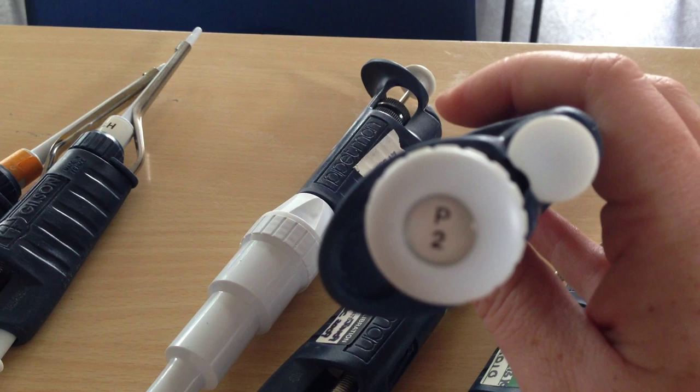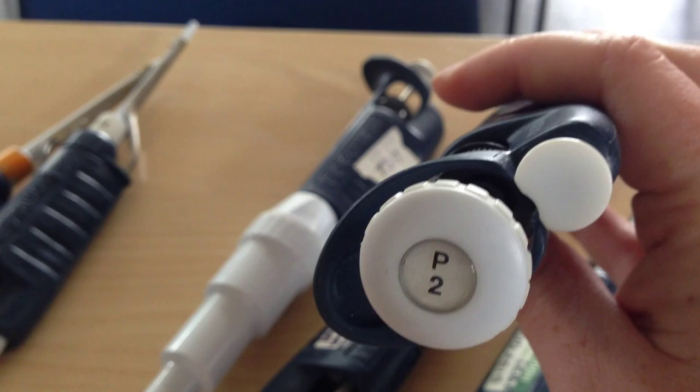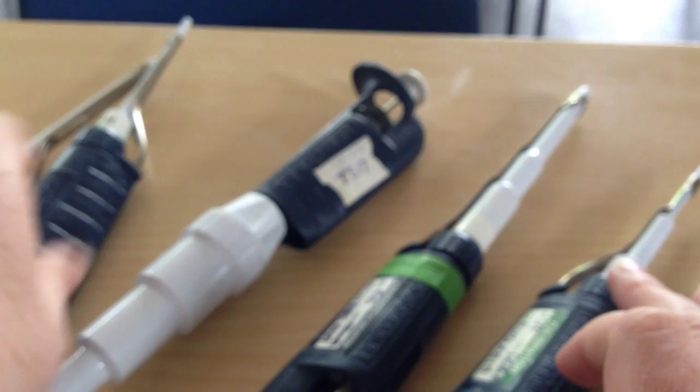Then we have a P2. You can use this for 1 or 2 microliters only. If you try and do 2.5 or 3 microliters with this, you are going to break the pipettes and it's not going to be accurate.